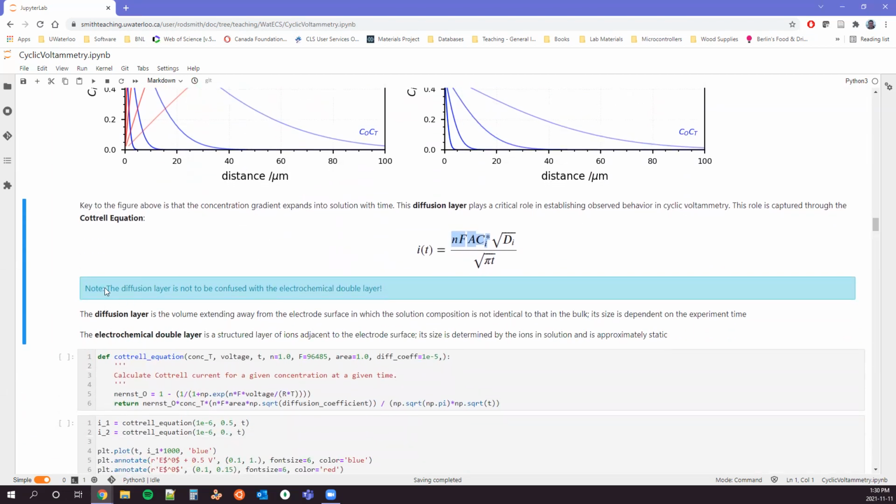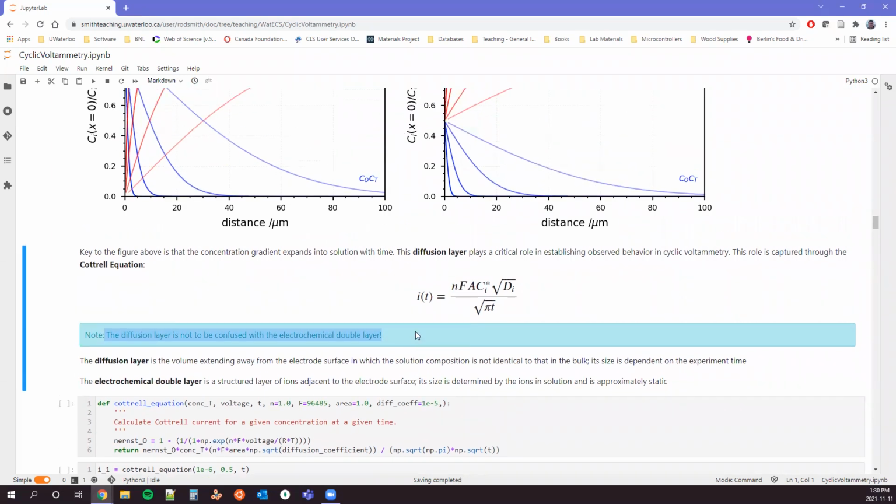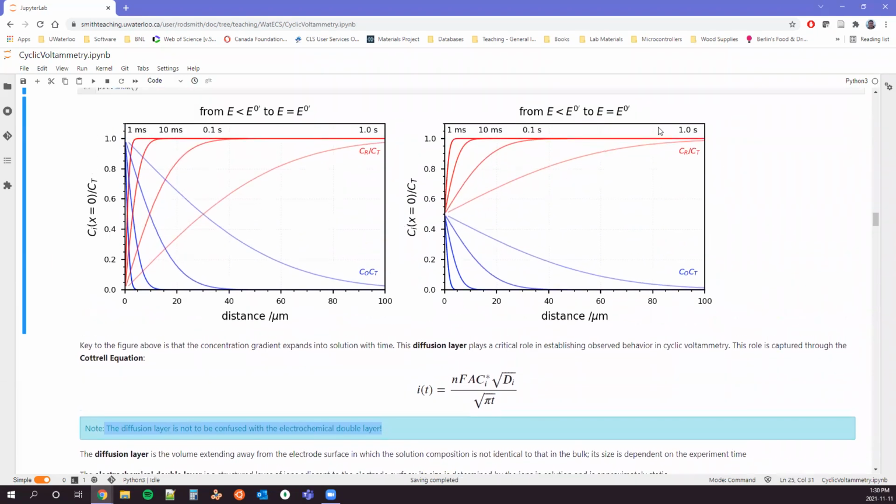It's important not to mix these up with the electrochemical double layer, right? And so the diffusion layer is this disruption in concentrations going out into solution, right? And so we've changed the equilibrium at the surface, and this has an impact reaching out into solution. The electrochemical double layer is a fundamentally different thing. This changes with time, right? Our diffusion layer will continually grow as long as we hold a voltage, as long as we hold a potential that's not what the system wants to be at in bulk solution.